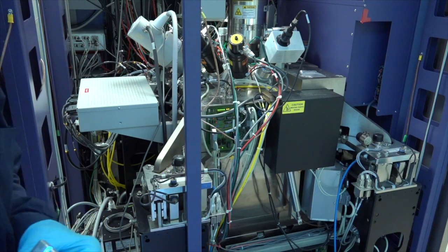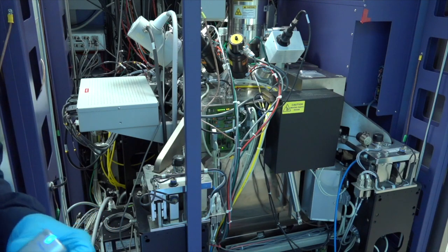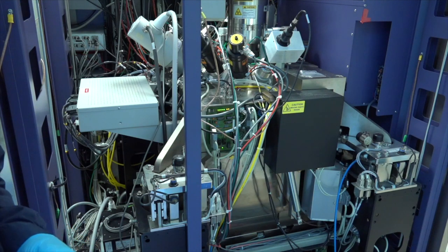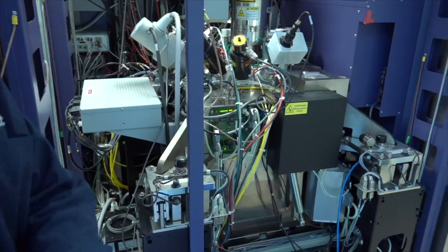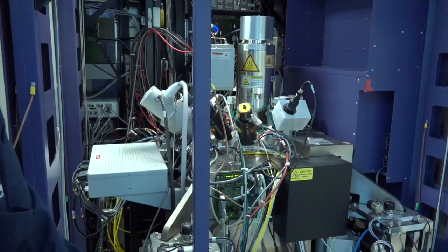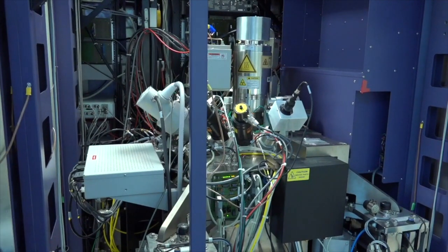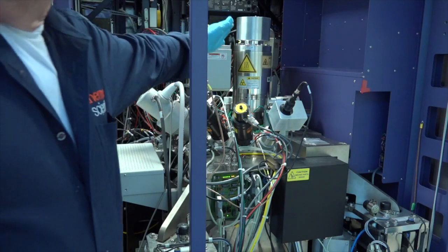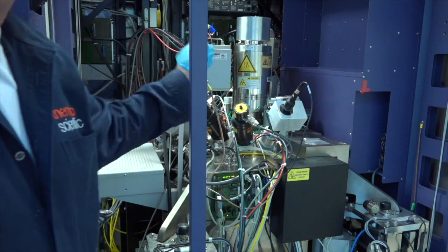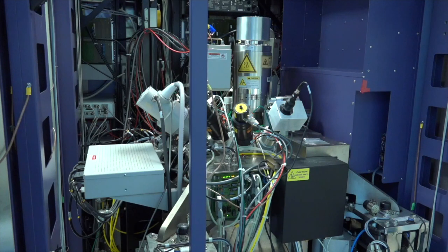You can also get a little bit of perspective on the columns here. The E column is here — let's see if I can tilt up the picture. The I column here, E column right there. So you can see how they're mounted on the backing stand.